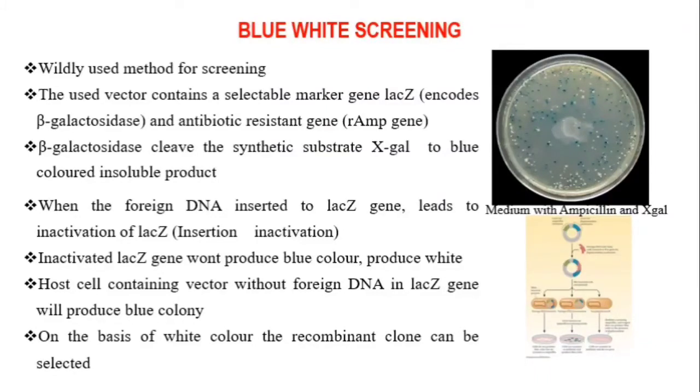When we transfer this lacZ gene into the bacteria, that bacteria will produce blue colored colonies due to the presence of the lacZ gene. The enzyme beta-galactosidase cleaves the colorless substrate X-gal present in the medium into a blue colored insoluble product.